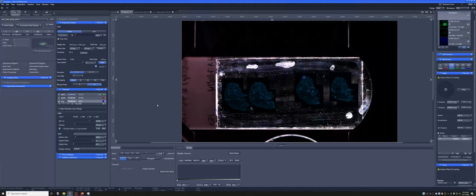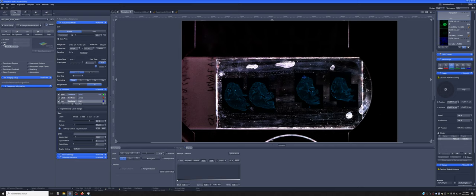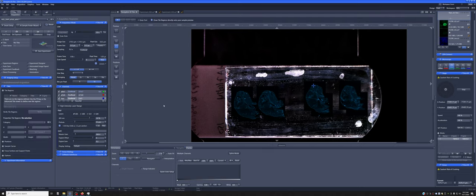In this video, I'm going to discuss some basic tiling and stitching. In this case, I've taken a preview of a slide using AI Sample Finder. Usually when AI Sample Finder finishes, the tiles module is on. If it's not, go ahead and turn it on because we're going to need it for what we'll do next.